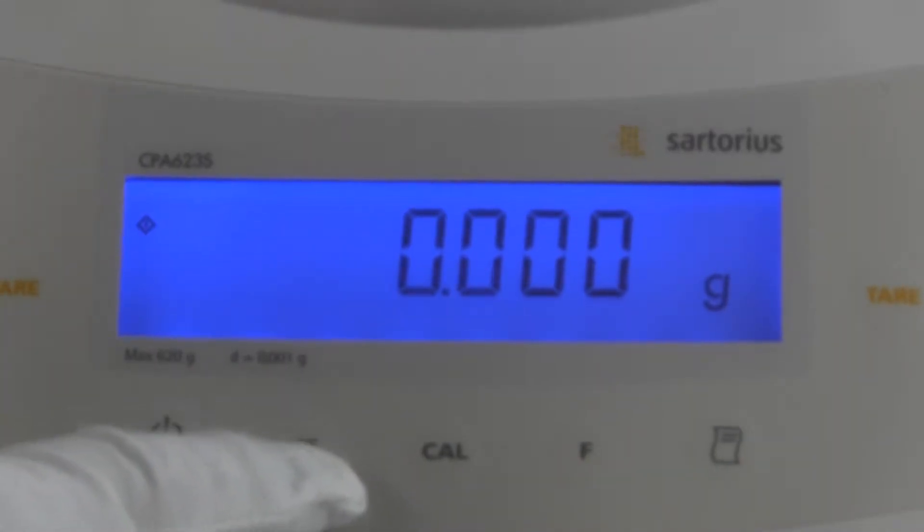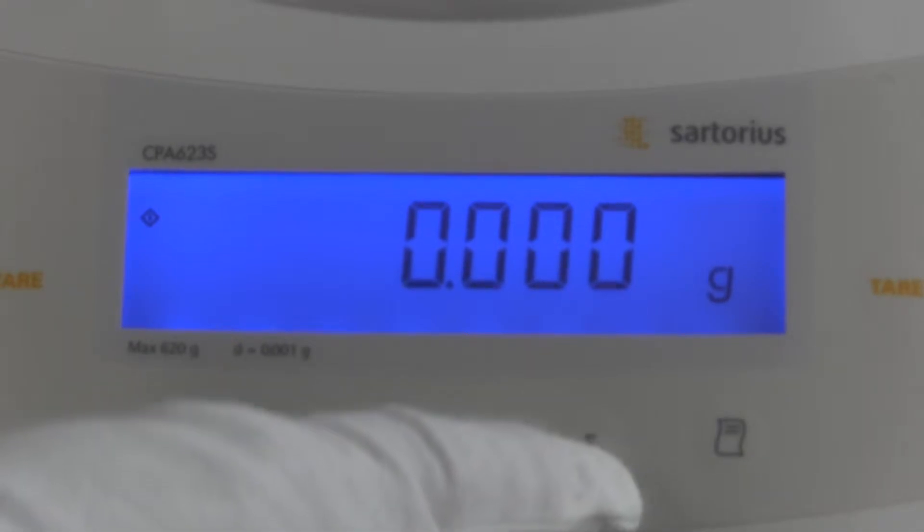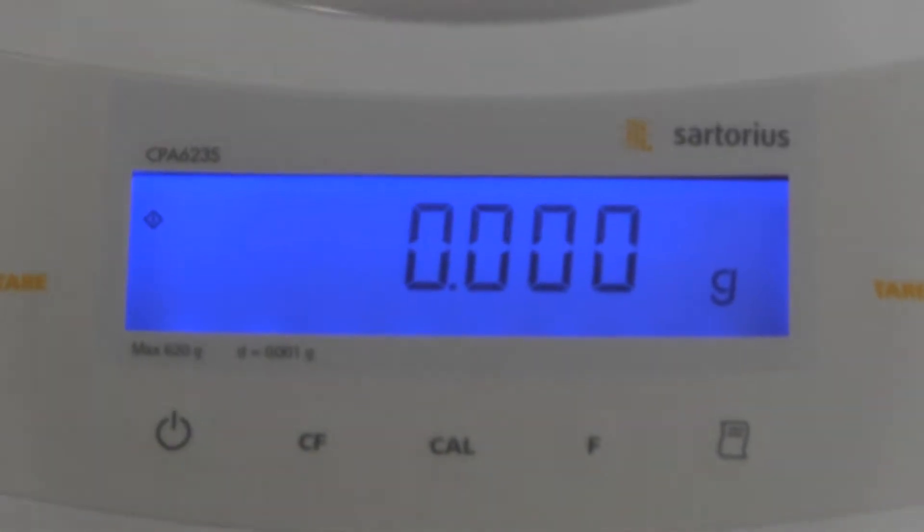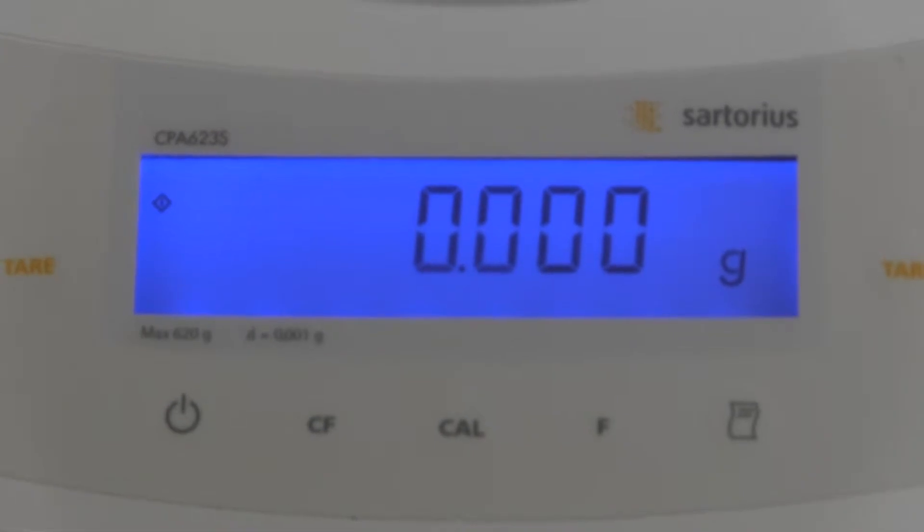We have the CF. This is the clear function. We have the CAL key. We have the F key, which is the function button. If we set this balance up for a second weigh mode, we could toggle. And then all the way over on the right-hand side is the print key. So those are the functions of the balance. Very simple for operation.